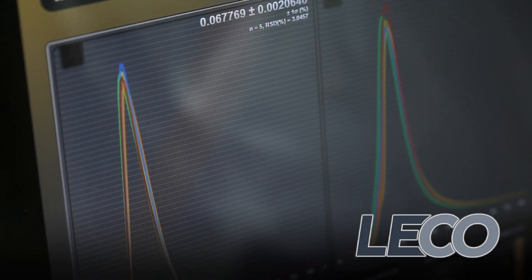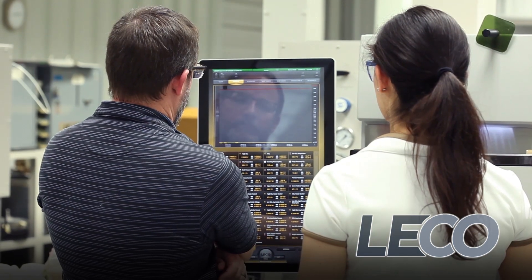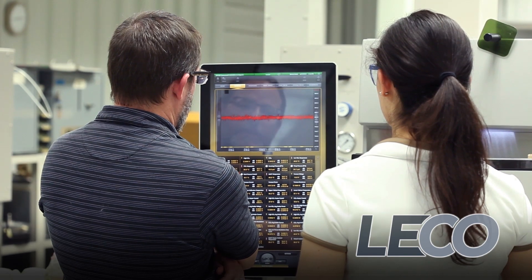Here at LECO, we strive to solve your most difficult lab challenges through user-friendly software, rugged designs, customizable configurations, and high-performance analyte detection.